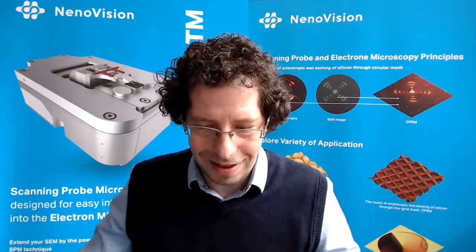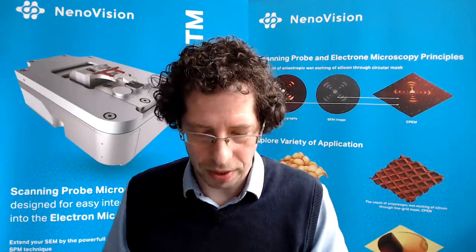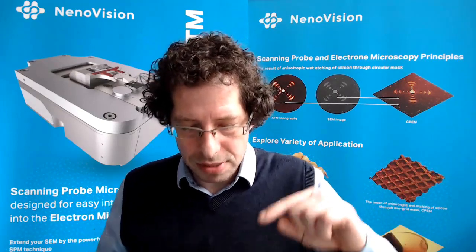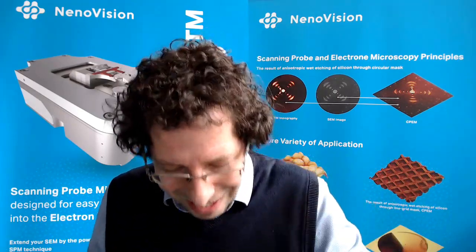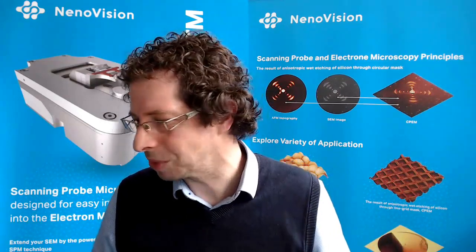For characterization, there is no need for venting the chamber if I want to use AFM and SEM. And in-situ means that I'm still analyzing the same thing in the same place at the same time.